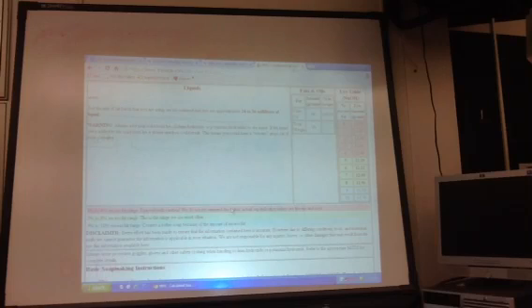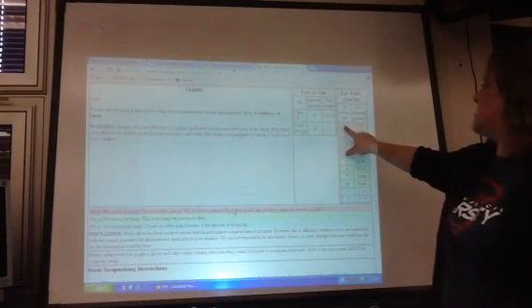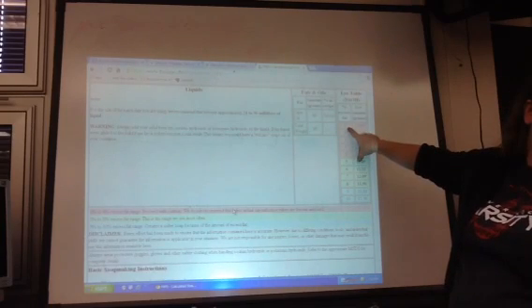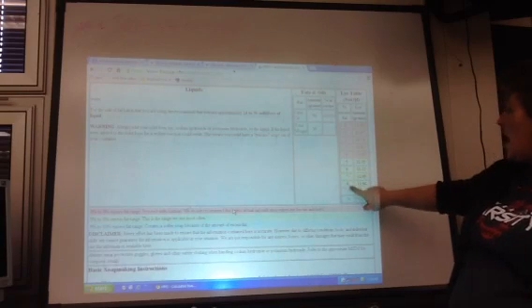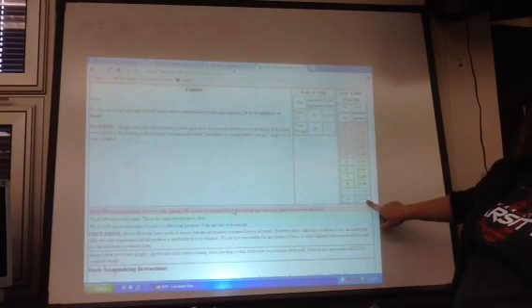And what this tells us is that if we look over here at the results, if we used 13 grams of lye, we would have 0% excess fat. We don't want to do that because we don't want to burn anybody's face off. If we wanted to have 10% excess, we would use 11.7 grams of lye. So we're pretty darn close, considering that we weren't using the correct formula for olive oil.